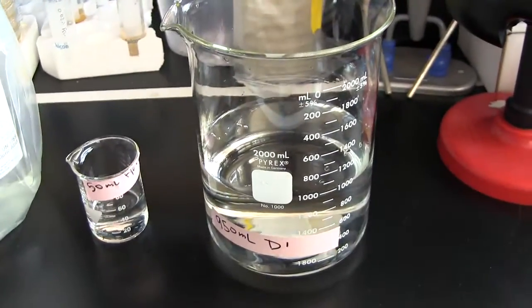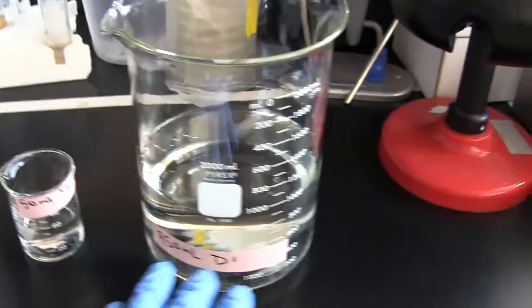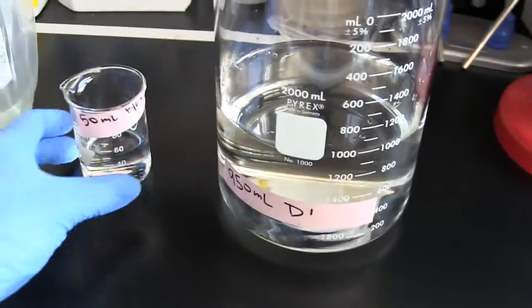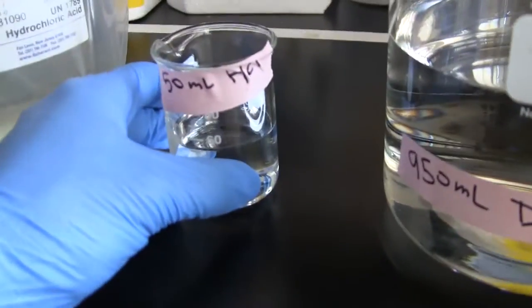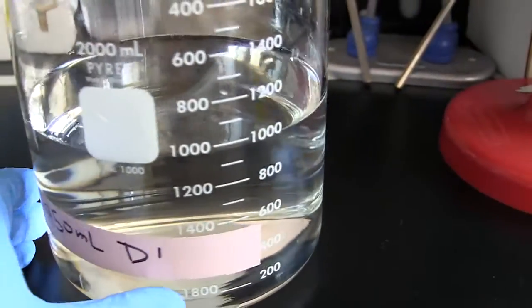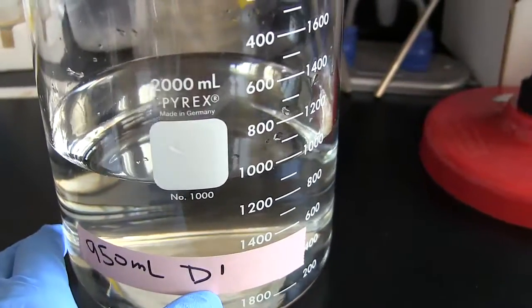So to do that, if we want to make a liter, we need to add 50 mils of hydrochloric acid to 950 mils of DI deionized water.